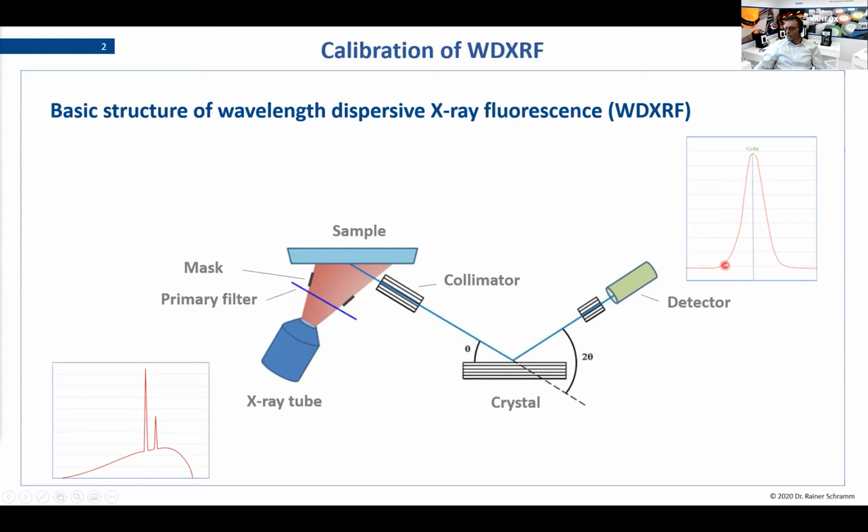And the scan is created by moving the crystal, moving this angle around the middle of the theoretical line. And then this kind of scan is produced. What we see as intensity in the end is just this height of the peak, either like it is here as a gross height, or if we also measure backgrounds, then it's only the net height where the background is subtracted before.